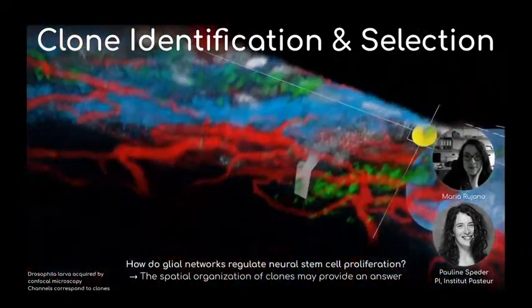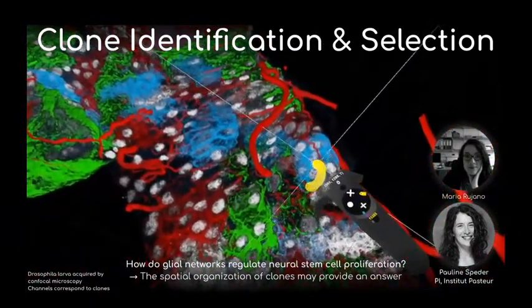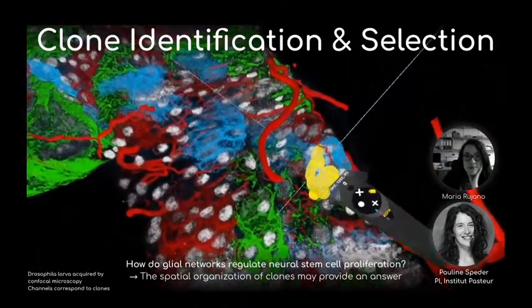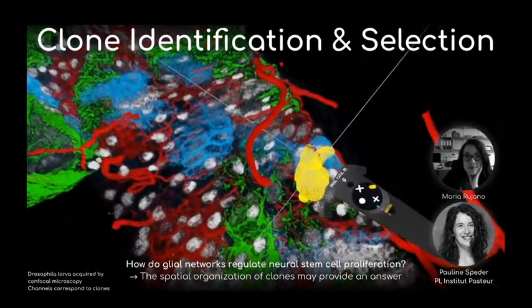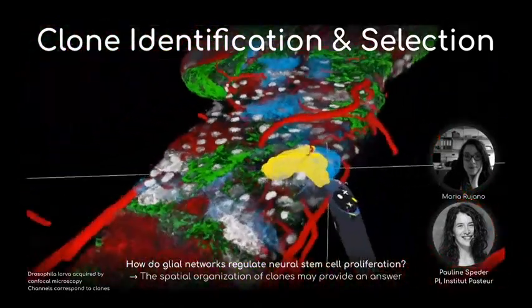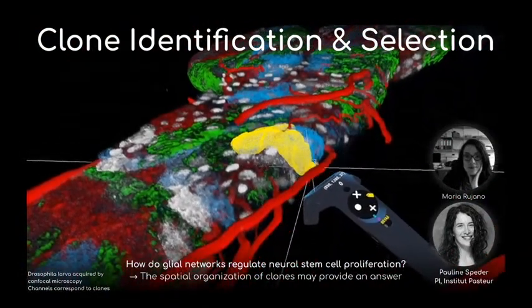As you can see, clones have entirely arbitrary 3D shapes, and imaging techniques are frequently subject to noise and artifact structures. Using DIVA's virtual reality context, the user, with their expertise in the topic, can identify and literally paint over the entire clone and export this information for post-analyses.